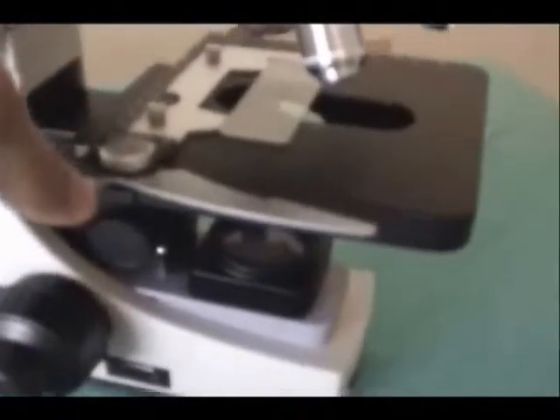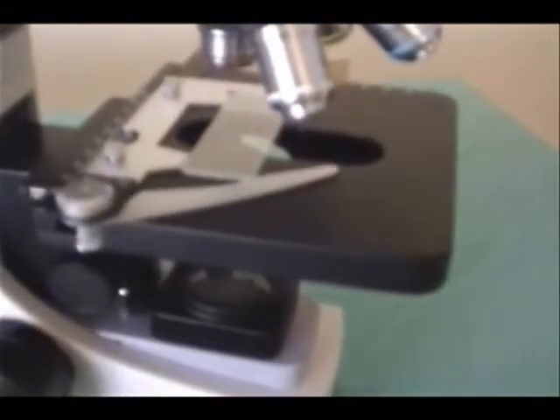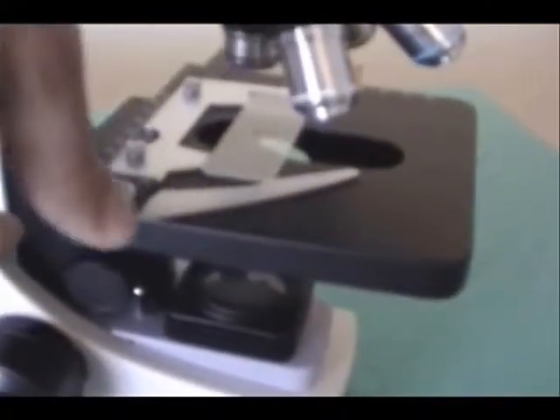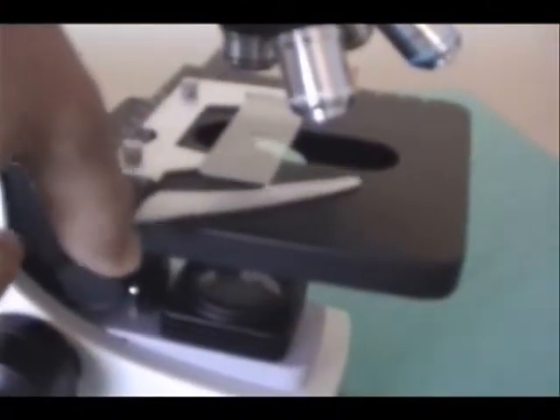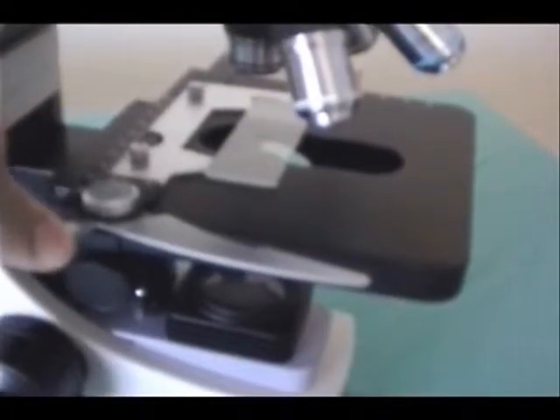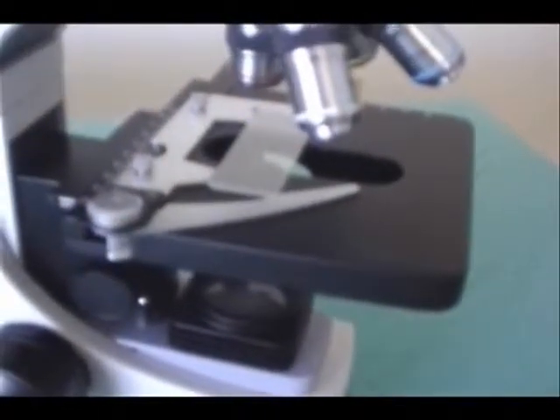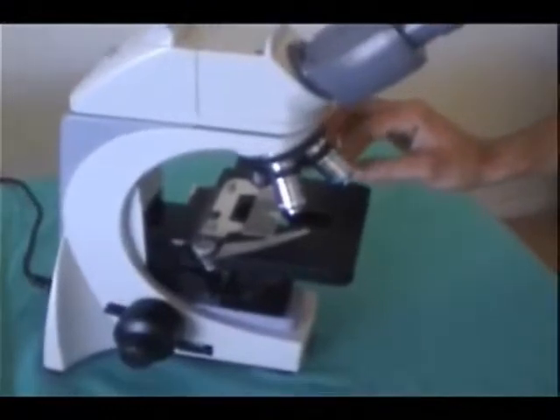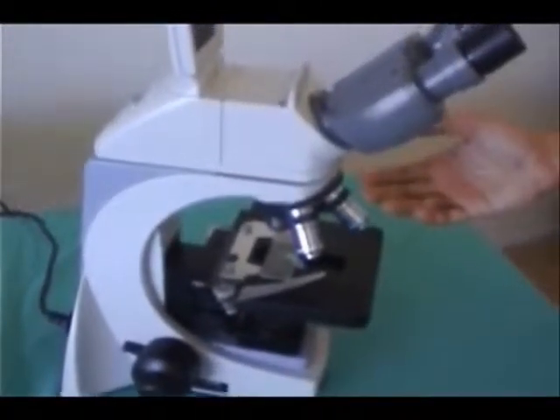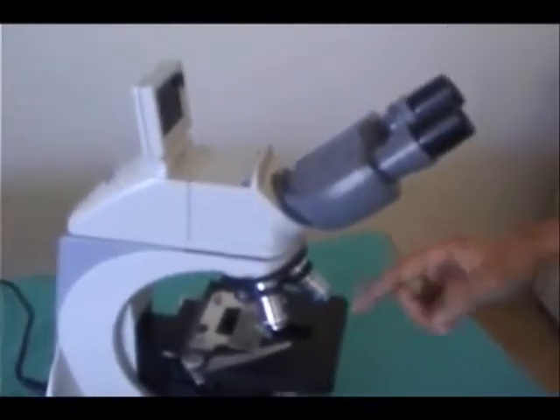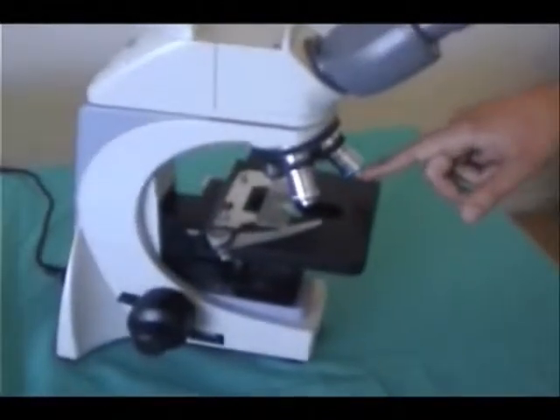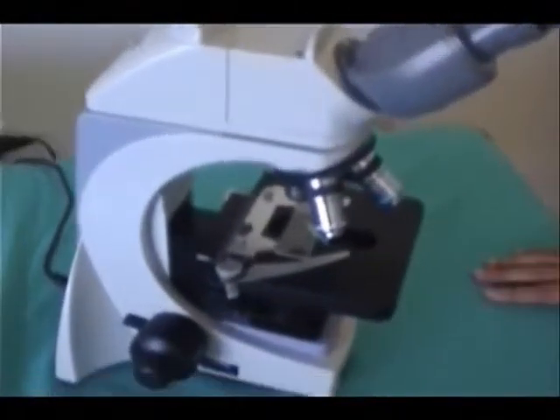A great feature about the stage is actually the stage clip. On most stages, they'll snap back and hit the specimen. But this one, as you can see, when you release, it slowly goes back and holds the specimen in place. And the specimen won't move after it's in place. This is a great feature because it will prevent some specimens from being broken and prevent injury because sometimes when it snaps back, the glass can break and fly everywhere.